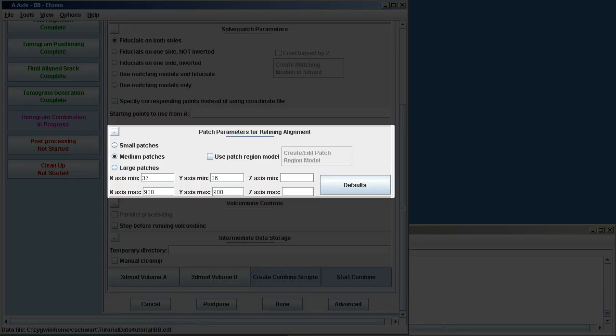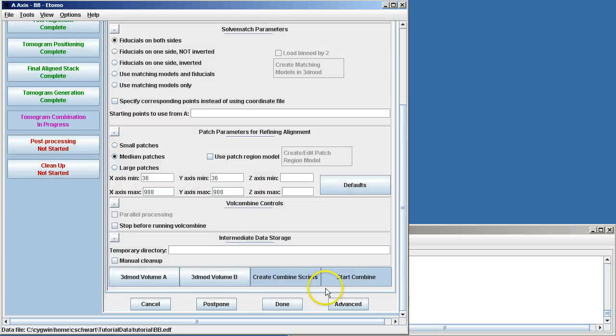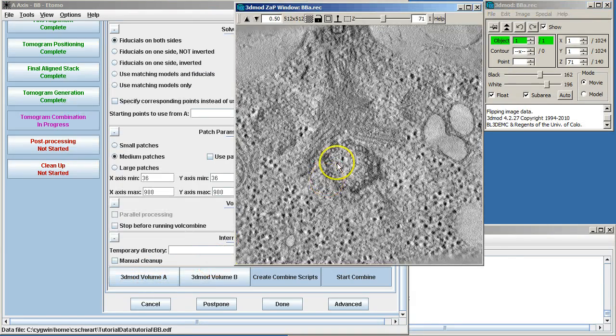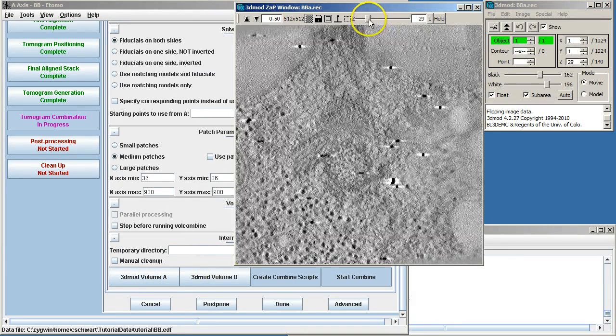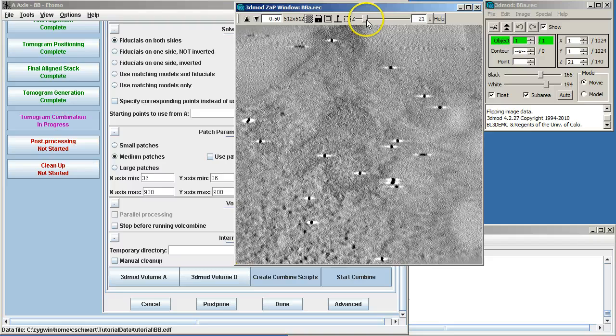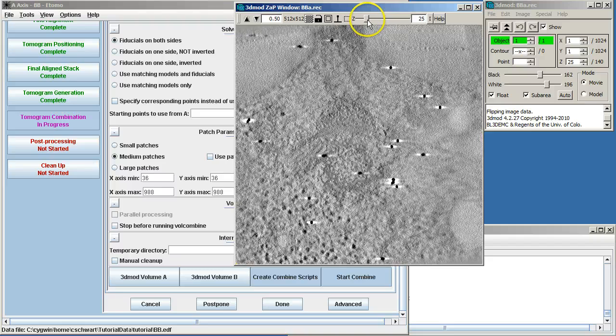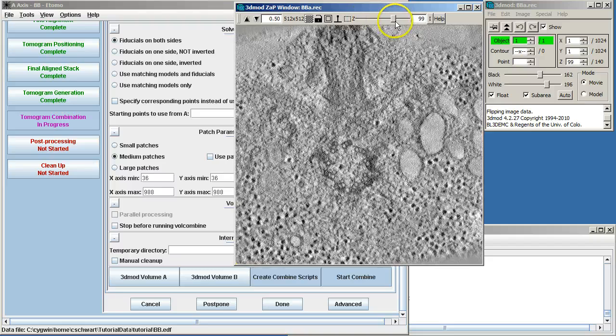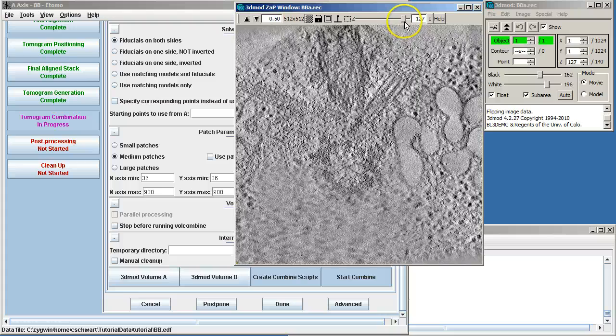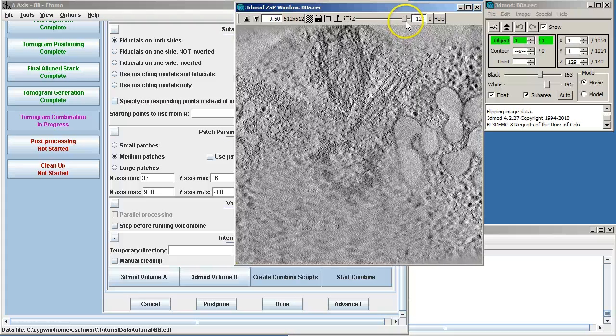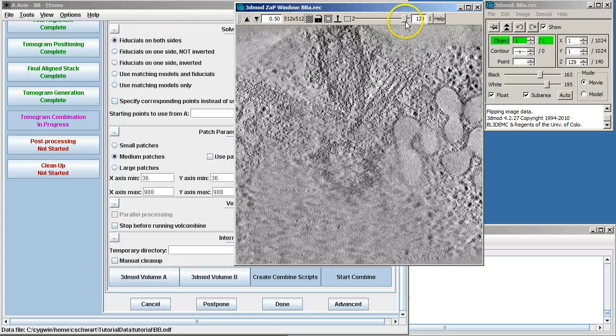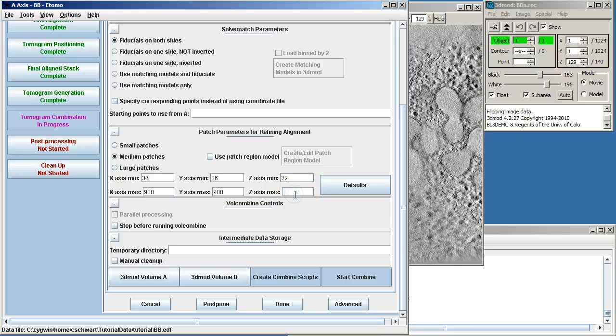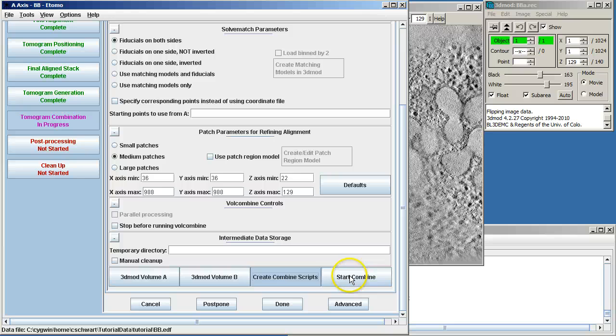And to do that, we will open the A volume, the one being matched to, and move down to the Z where we see information of the cell, which was around 22 on that surface. And then this surface is 129. So we're going to fill in the Z-axis minimum and maximums, create our combine scripts, and start combine.